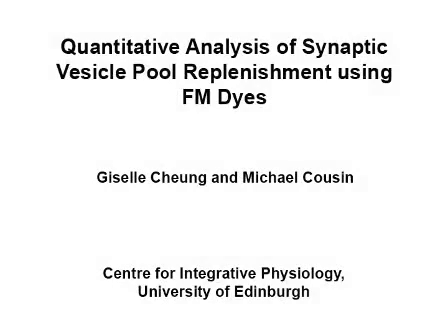The overall goal of the following experiment is to quantify the replenishment and mobilization of the specific synaptic vesicle pools in central nerve terminals using live fluorescence imaging techniques.